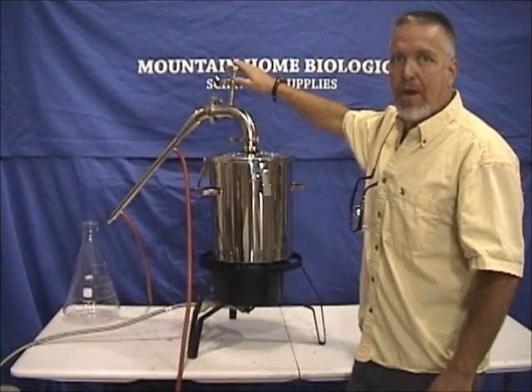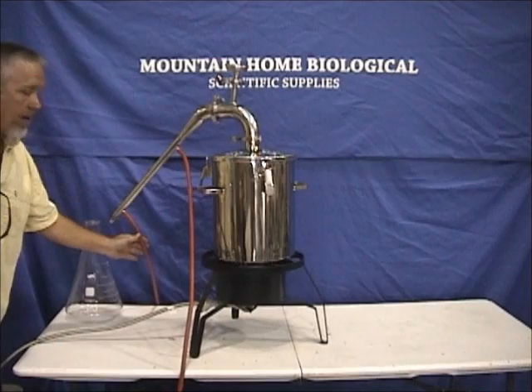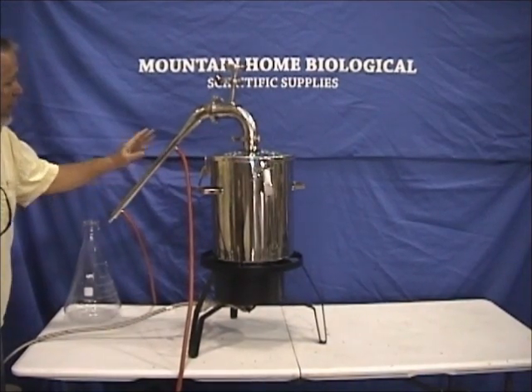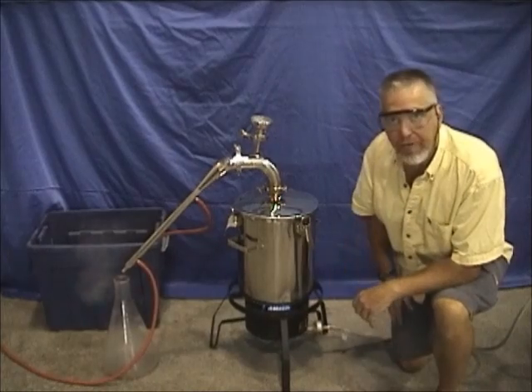Up here we have a thermometer so you can watch the progress of the heating. Here is an in-hose that brings cool water into the condenser, and then the cool water comes out this hose — we've just got it going into a bucket.